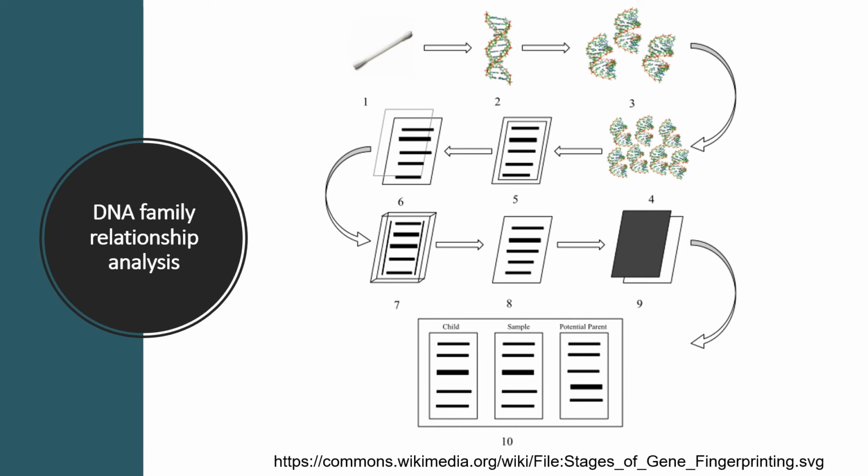One, a cell sample is taken, usually a cheek swab or blood test. Two, DNA is extracted from the sample. Three, cleavage of DNA by restriction enzyme. The DNA is broken into small fragments. Four, small fragments are amplified by the polymerase chain reaction, resulting in many more fragments.